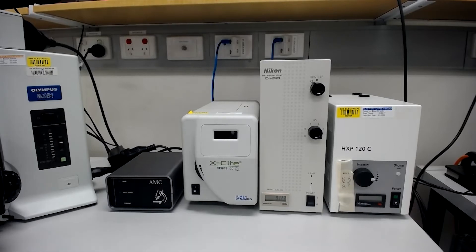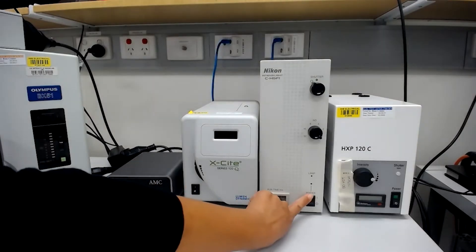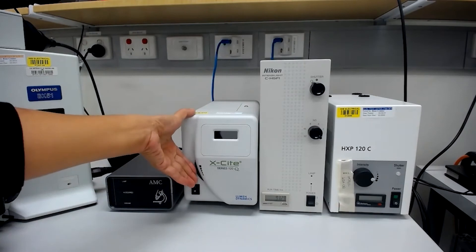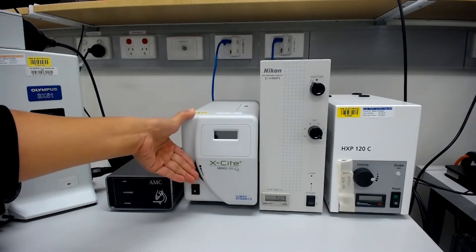If the lamp doesn't turn on when you turn on the lamp via the icon on the desktop, check the power switch is turned on. The intensity of the Excite can be controlled with the dial at the front.